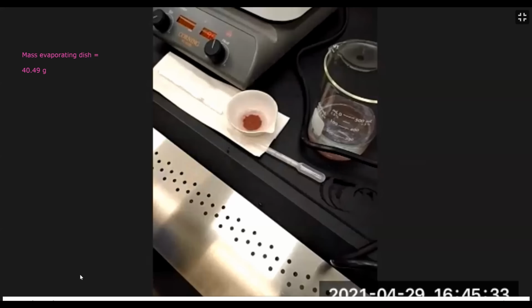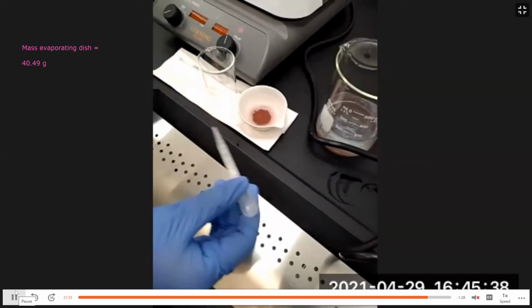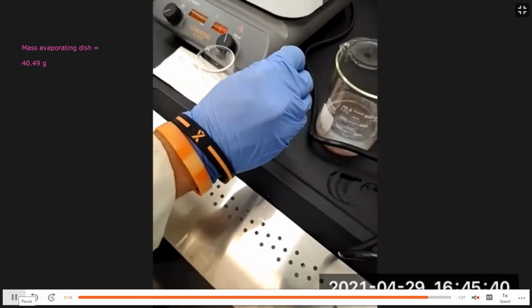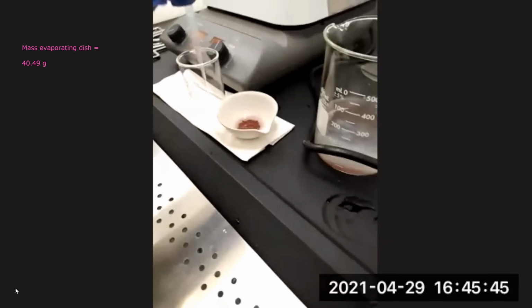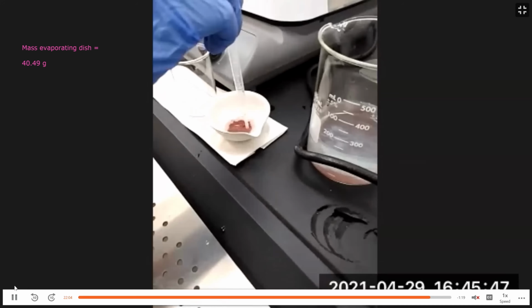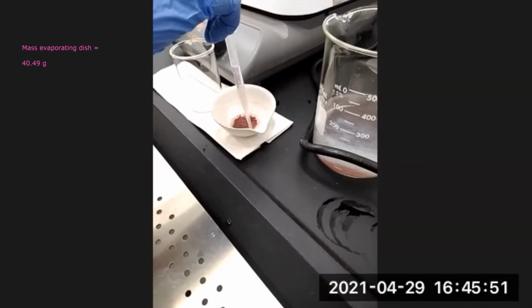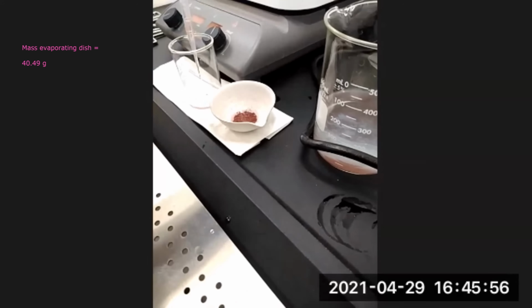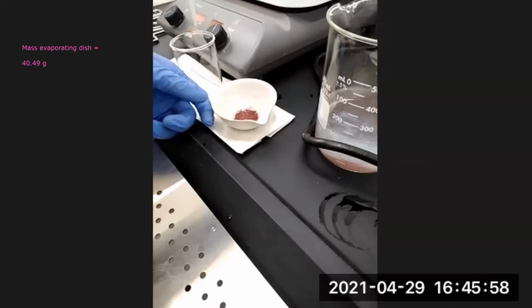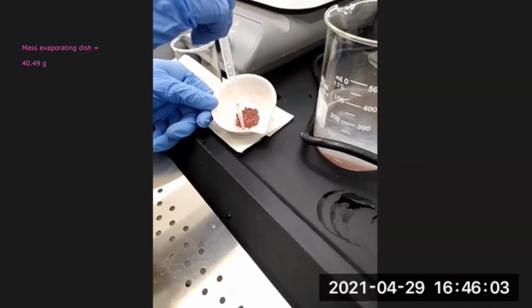Again, we're doing one more washing and extracting out the solvent. So in this washing, unlike the previous ones where we were using water, that was my mistake. So in the previous one, we were using water. Here we're using the methanol / acetone because it's in its own beaker. So organic solvents have their own waste container separate from the other waste containers.